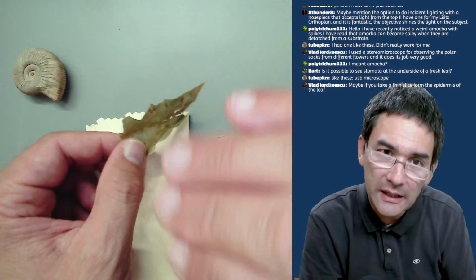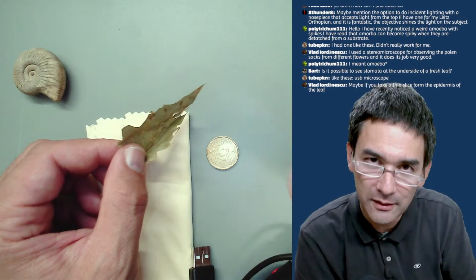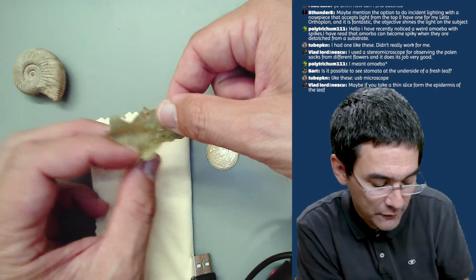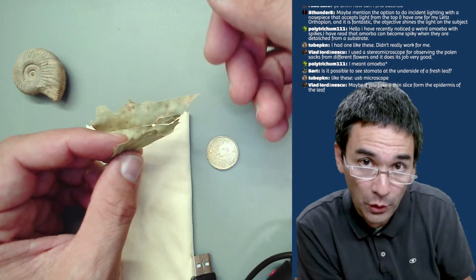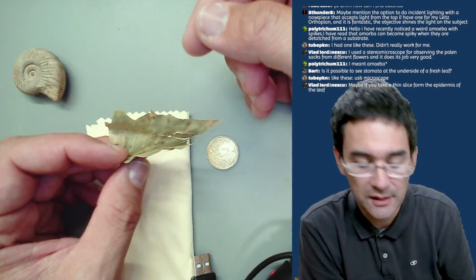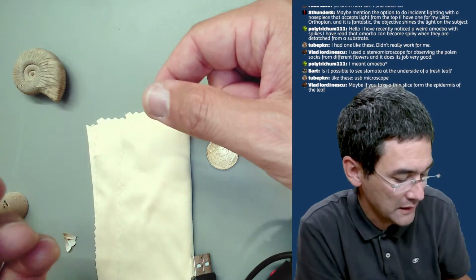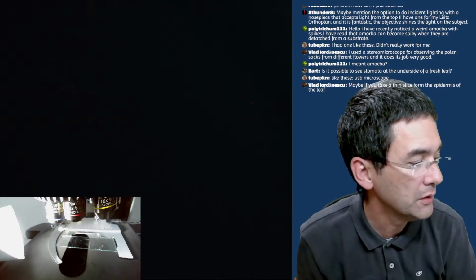So what you're getting is the surface texture of the leaf, and then you put the glue under the microscope. You can see the stomates really well this way. Then you don't need to slice it. But the question now is, if you put a complete leaf directly under the microscope, are you also able to see that? And I don't know, because I simply have to try this out. So this is something that I might experiment around with as well. I mean, I can put this leaf again under the microscope. It's a dry one, so I don't have very high expectations here.